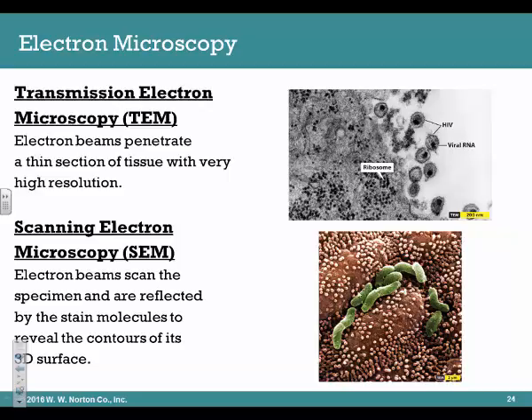But in the case of scanning electron micrographs, the computer is used to add color. So in the image below, you can see the difference between the green objects, which are the bacteria Helicobacter pylori, which many of us carry normally in our stomach, and these are the gastric cells of the lining of the stomach, colored in this kind of tan color.